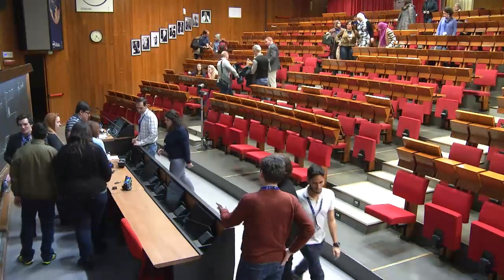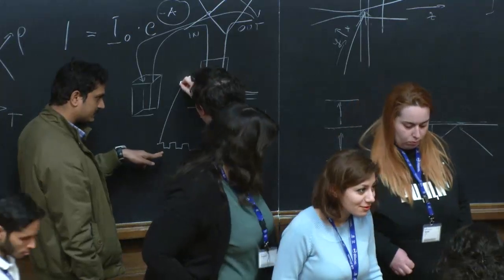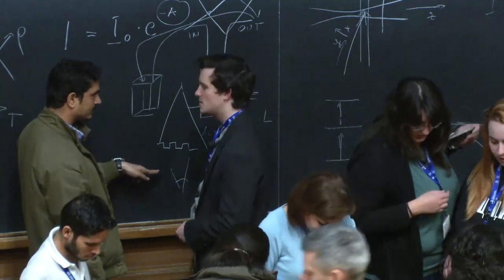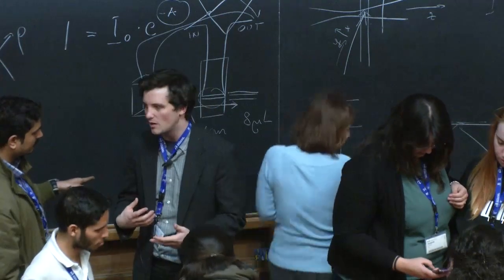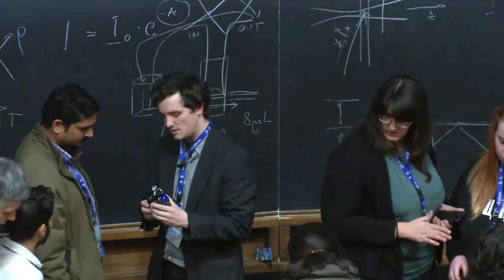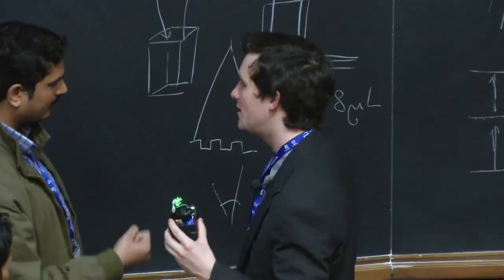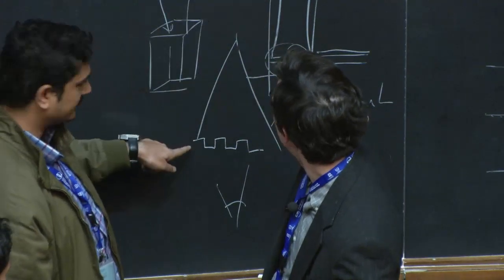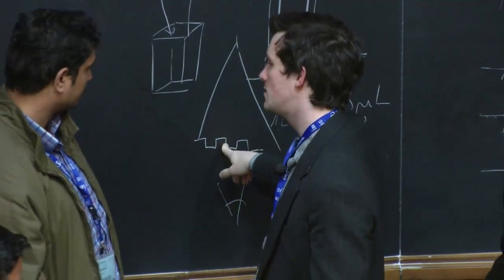Localized surface plasmon resonance is for nanostructures. So that is very easy. We just have a nanostructure on this, and we just shine light down at normal incidence and capture it with a camera. It's transmission. It can be done with reflection also. Yes, absolutely. Transmission seems to be more sensitive, according to the literature, but this device is just transmission. You have LEDs, you have a sensor here, and it's just that simple. You do not need a Kretschmann configuration to couple into localized surface plasmon resonance.